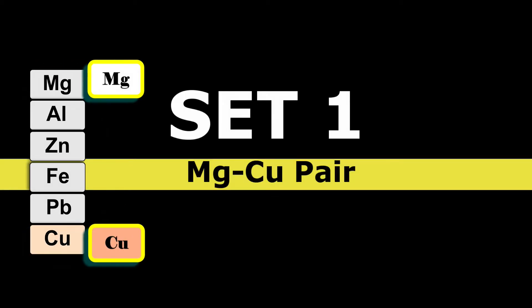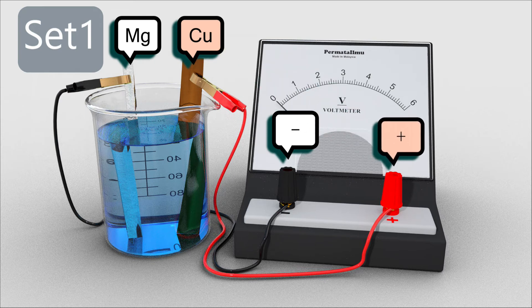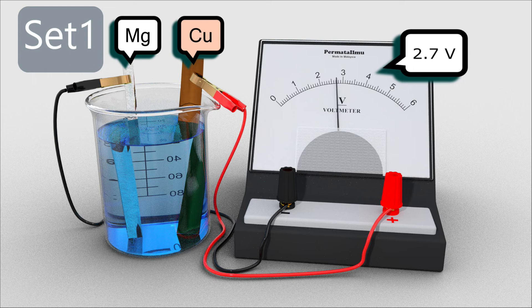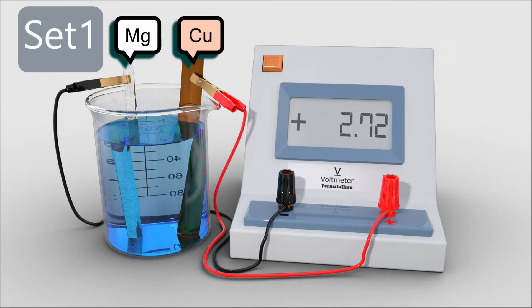For the first set, both magnesium and copper are immersed into the copper(II) nitrate solution. Magnesium is connected to the negative terminal of the voltmeter and copper is connected to the positive terminal. Once the circuit is complete, the voltmeter shows a reading of approximately 2.7V. Using a digital voltmeter, a more accurate reading is found to be 2.72V.